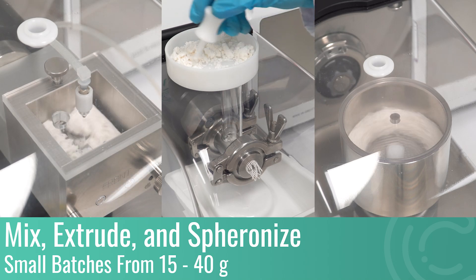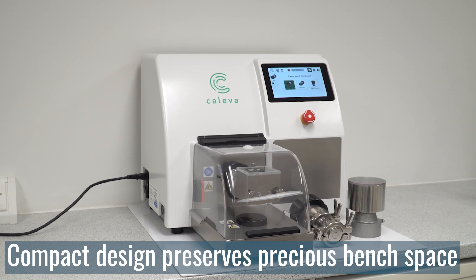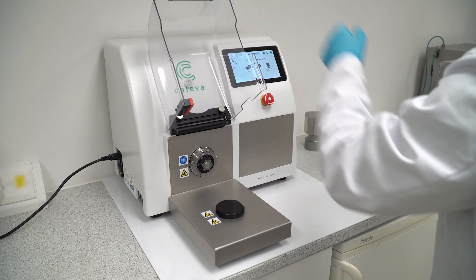Mix, extrude and spheronise small batches from 15 to 40 grams in a single benchtop unit. The Multilab Classic has a compact design that preserves precious bench space whilst simultaneously saving time with an easy to use control interface and rapid experiment turnaround ability.